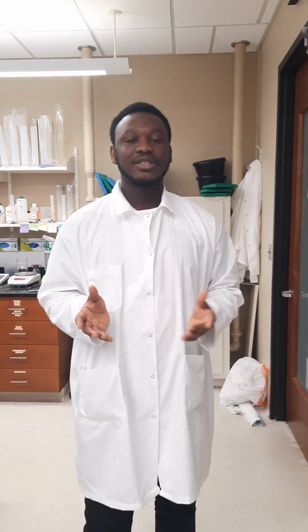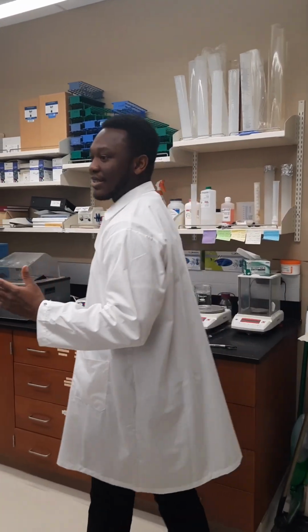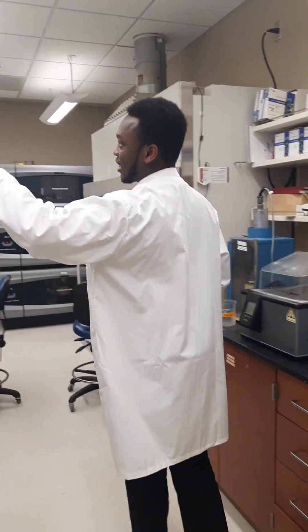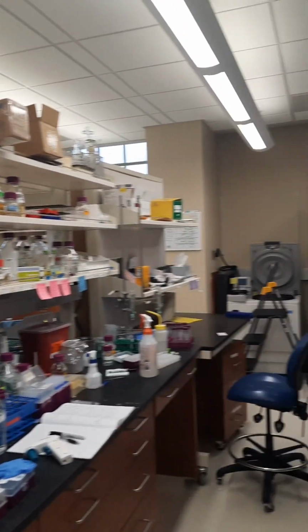And secondly, we are going to try to understand the different reactions that their biosynthetic enzymes catalyze. In order to do this, we'll use a lot of bioinformatic tools, biochemical reactions, and structural biology. So I'm going to be showing you around my lab, and we believe that by doing this, we'll be able to produce natural products that solve the problem of antimicrobial resistance. So basically, this is my lab space, and this is how a normal, more biochemical lab looks like.